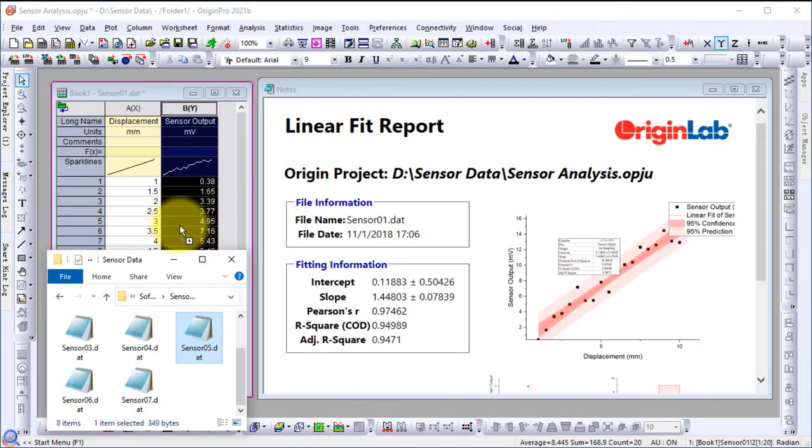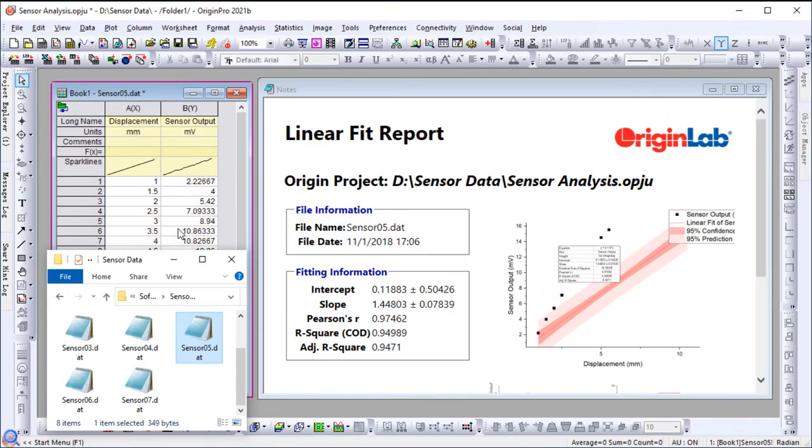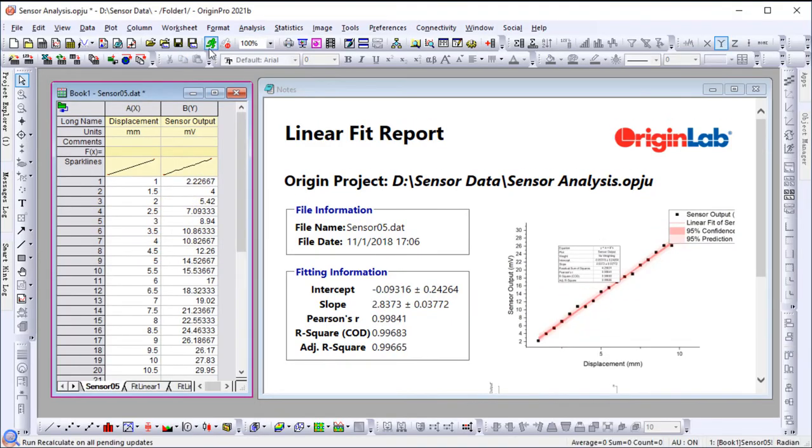Simply drag and drop a new data file to replace the original data, and the analysis results and report are all automatically updated, all without writing a single line of code.